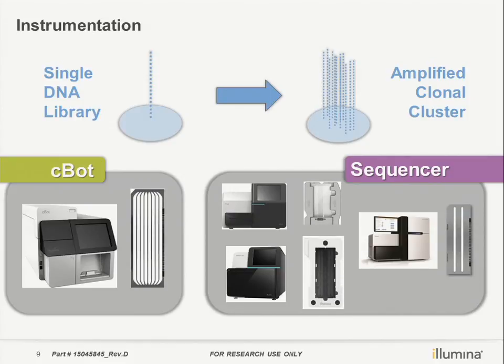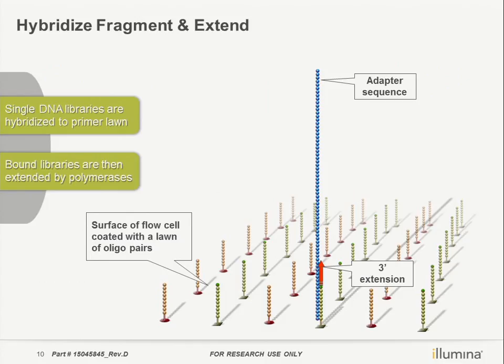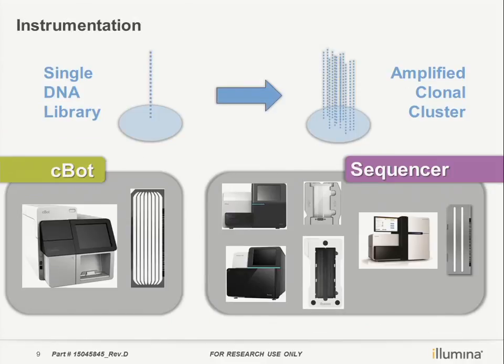And these are different flow cells for these different instruments. So this is the flow cell for NextSeq, which is the biggest among all those instruments that we are currently offering. So this is a single lane. So for NextSeq, it's only a single lane, not like the HiSeq. For the flow cell, we have 4 lanes.